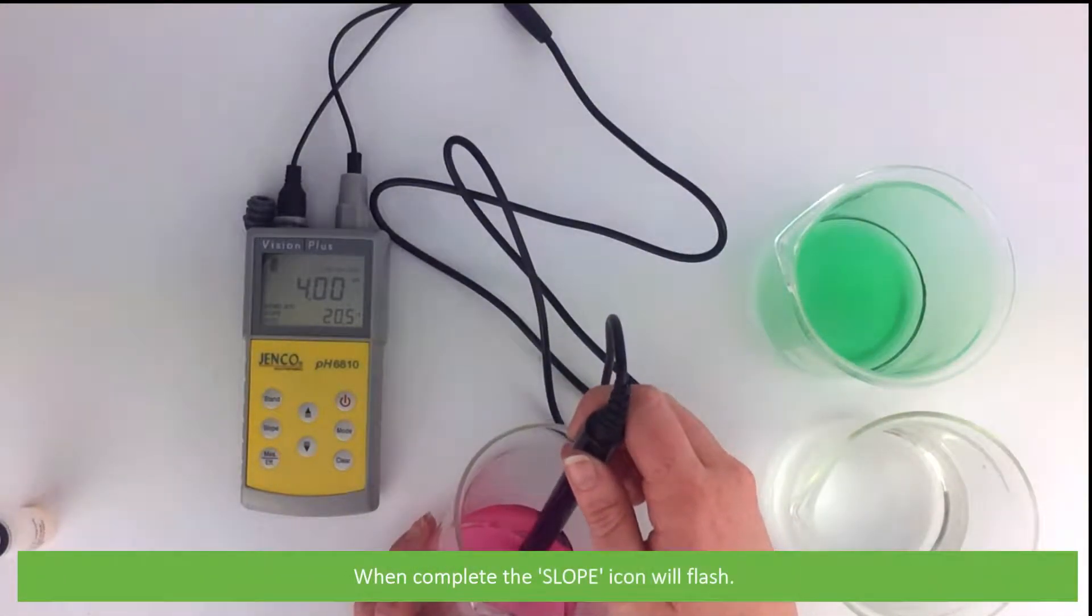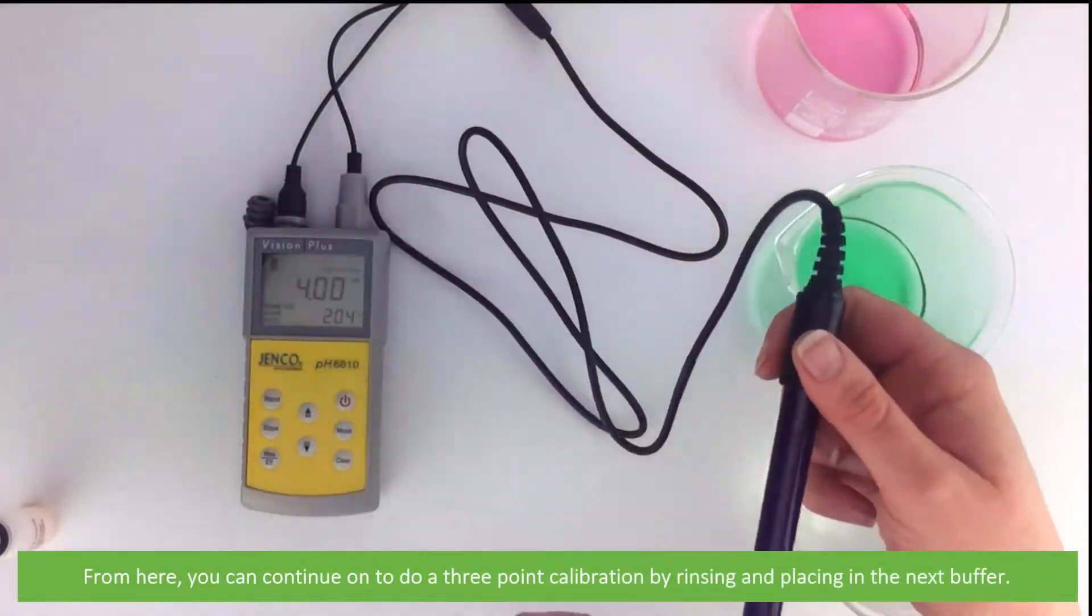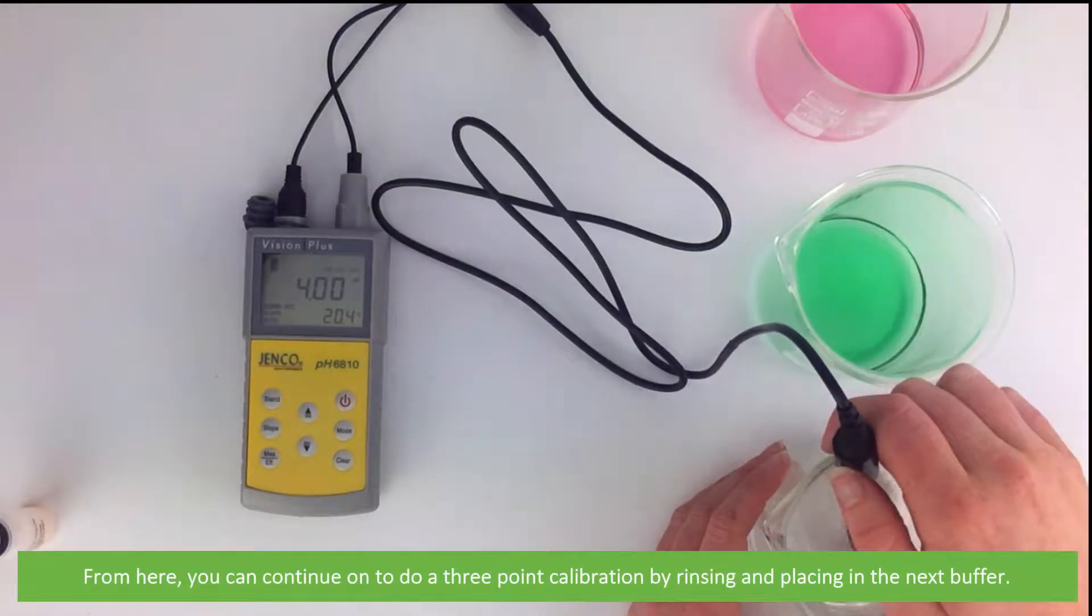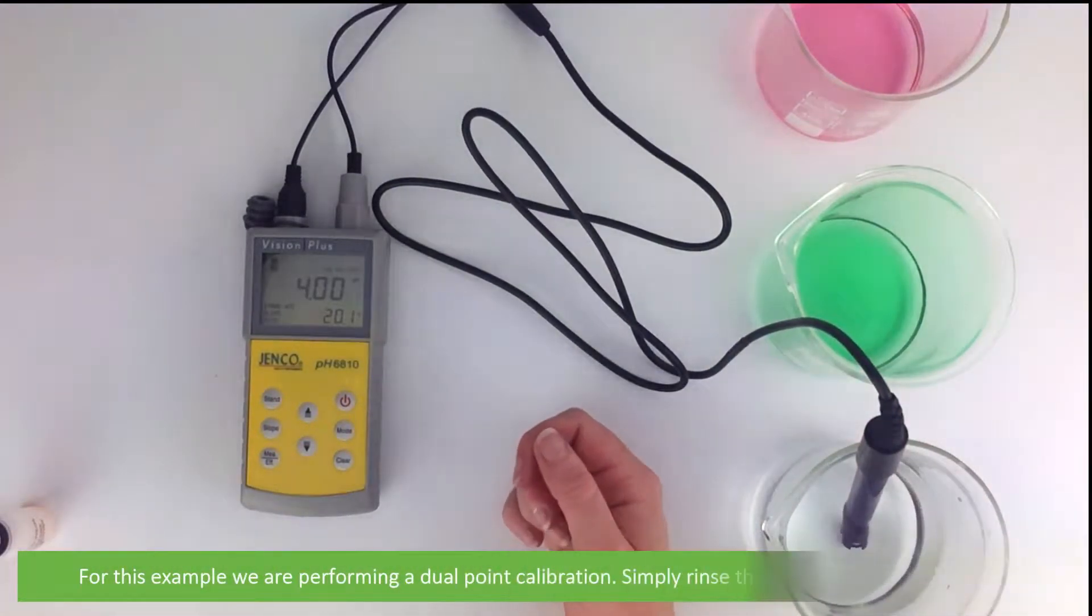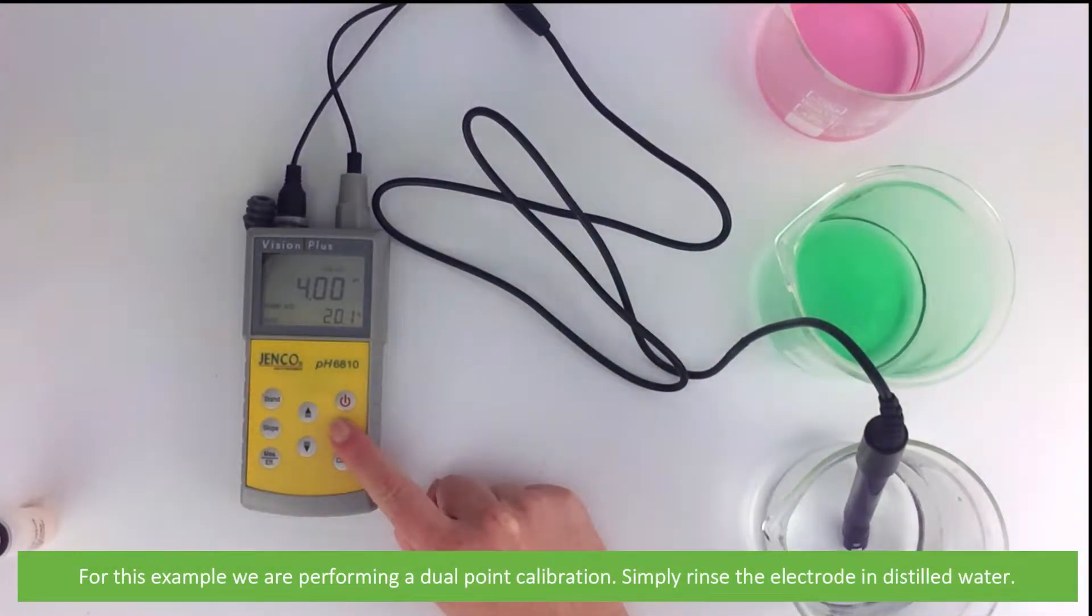When complete, the slope icon will flash. From here you can continue to do a three-point calibration by rinsing and placing in the next buffer, but for this example we are performing a dual-point calibration.